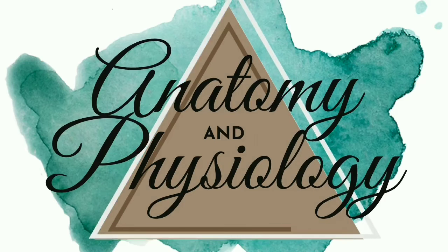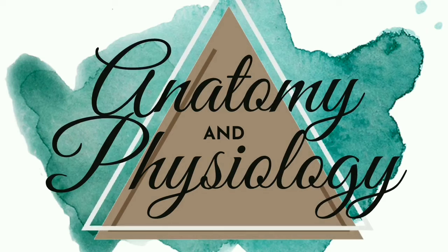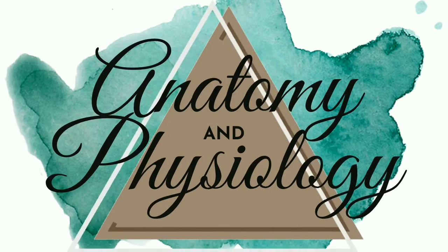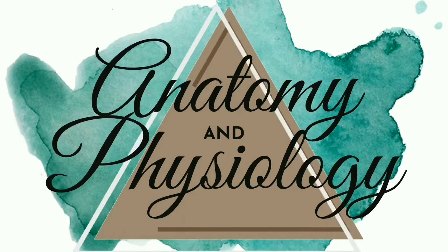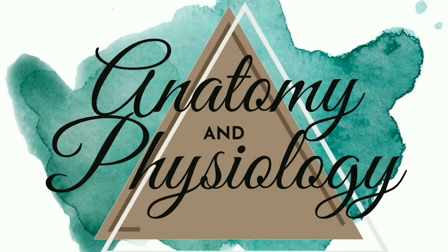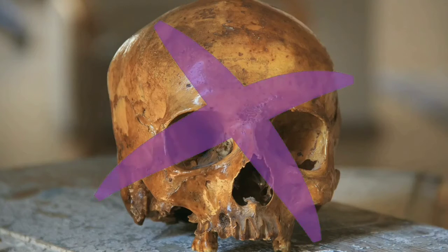The answer is in the study of anatomy and physiology. Anatomy is the study of body structures, and physiology is the study of how those body structures function. Since it is illegal and inhumane to dissect a real-life human being, we use a frog instead to learn our anatomy. One reason frogs are often chosen to be dissected is that their bodies provide a good overview of the organ systems of a complex living thing. The organs present in a frog and the way they are laid out in the body are similar enough to humans to provide insight for students about how their bodies work.